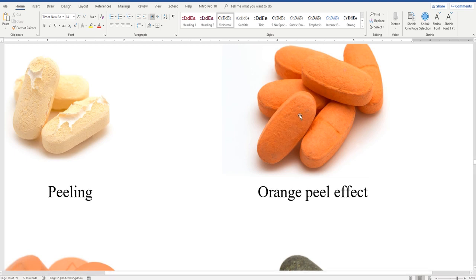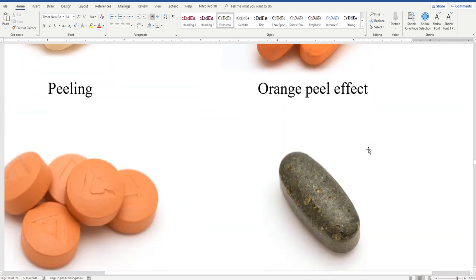But they failed to coalesce with each other and spread as a film. One important reason could be the high viscosity. You see how high viscosity is a problem. The high viscosity did not allow the film to distribute evenly on the surface of the tablet.